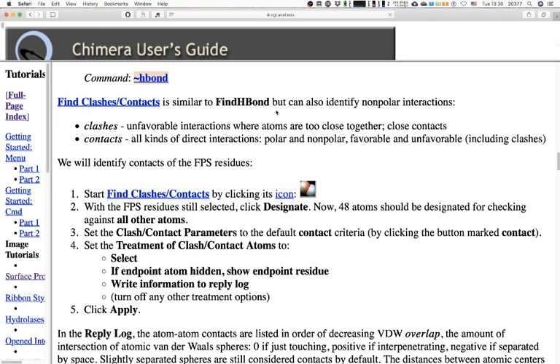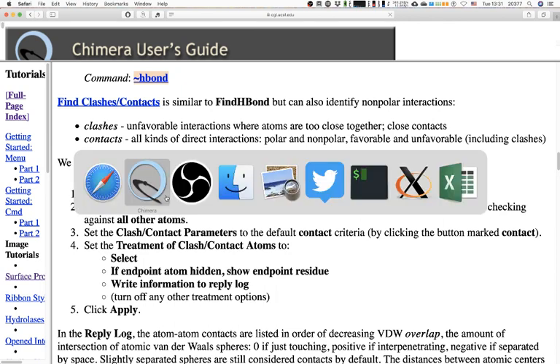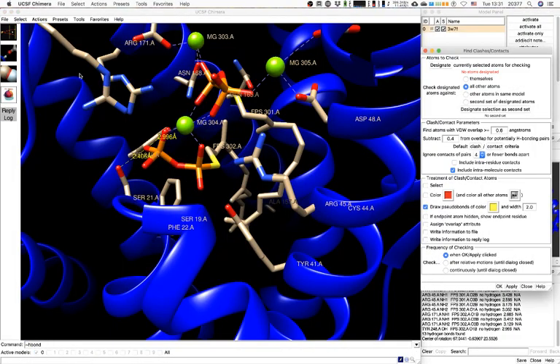Next we'll find the clashes. Clashes is similar to Find H Bond but can also identify non-polar interactions and contacts. This is going to be different because the selection doesn't happen in the select window. So let's go to the Find Clashes icon. We need to select the FPS first — with that selected, designate the atoms for checking.